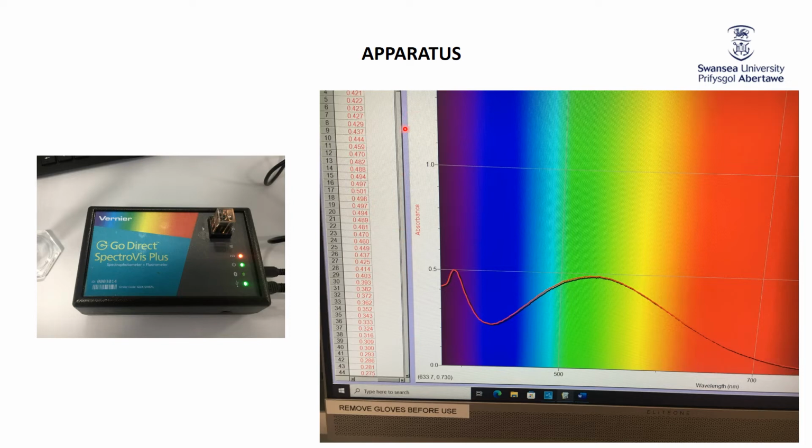Absorbance is up here. So what we see is that the sample isn't absorbing much of the red, absorbs a little bit in the higher wavelengths of red, a little bit of the orange, peaks in the green spectrum, okay, and then goes back down, isn't absorbing as much here, absorbs a little bit up in the purple as well.